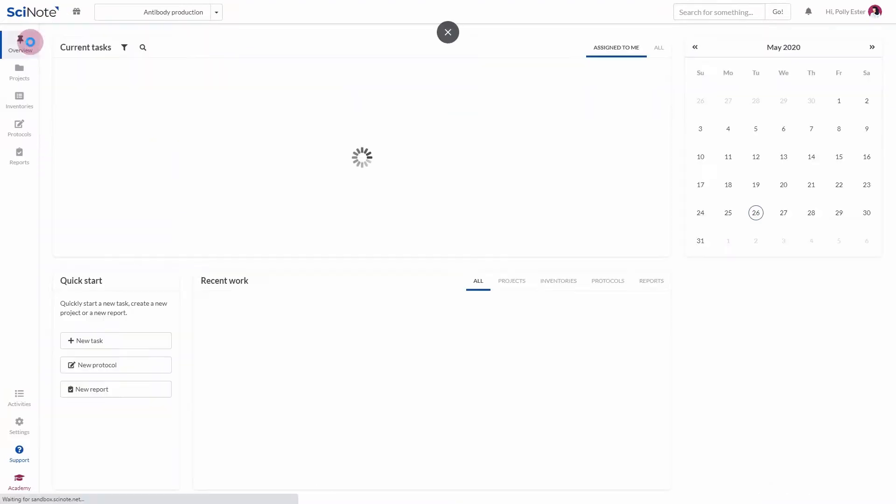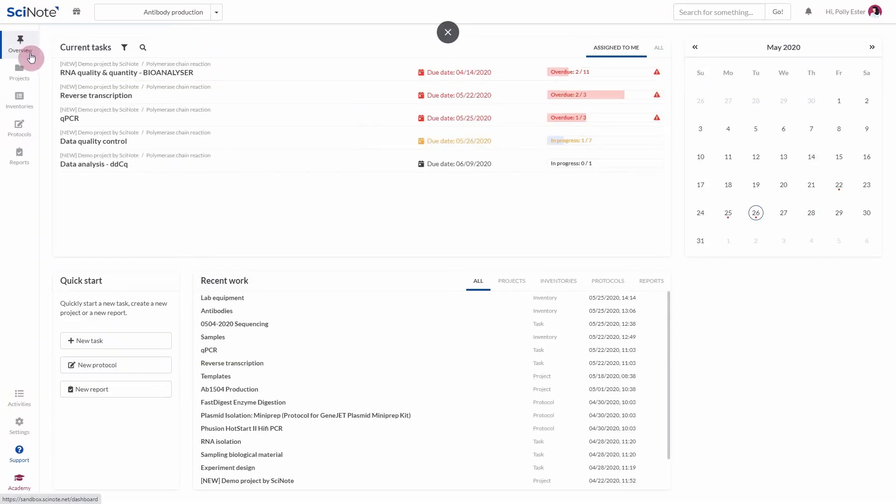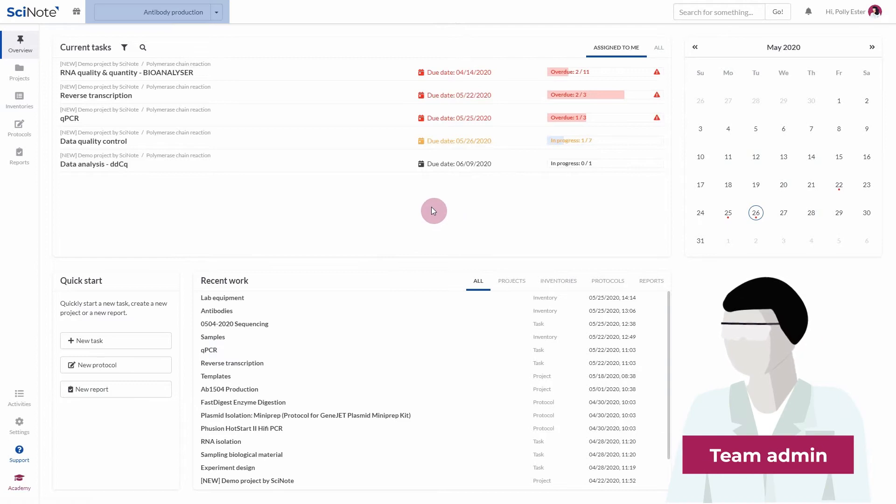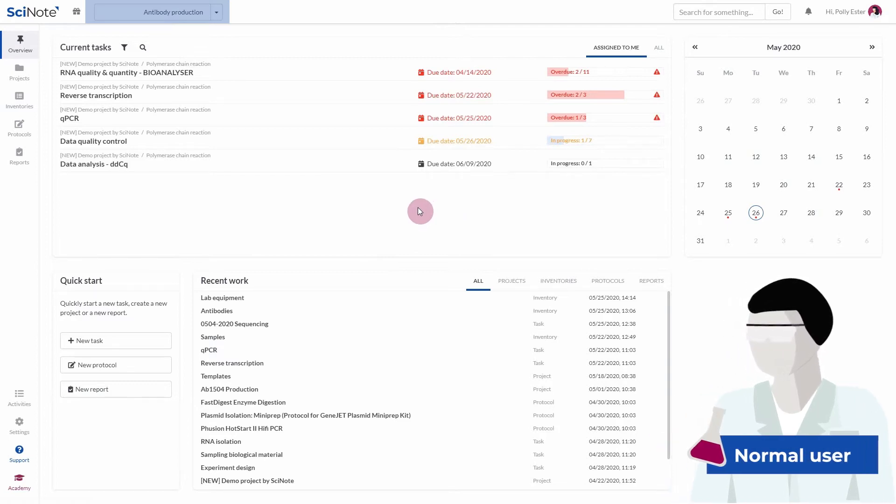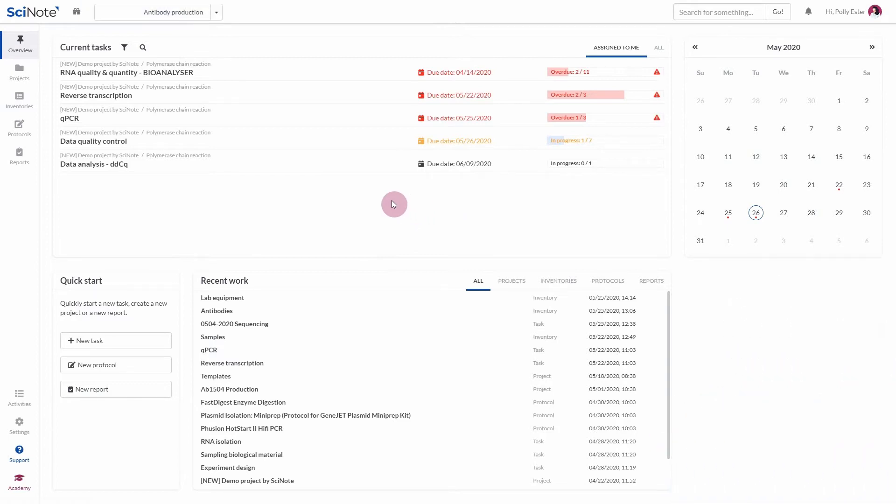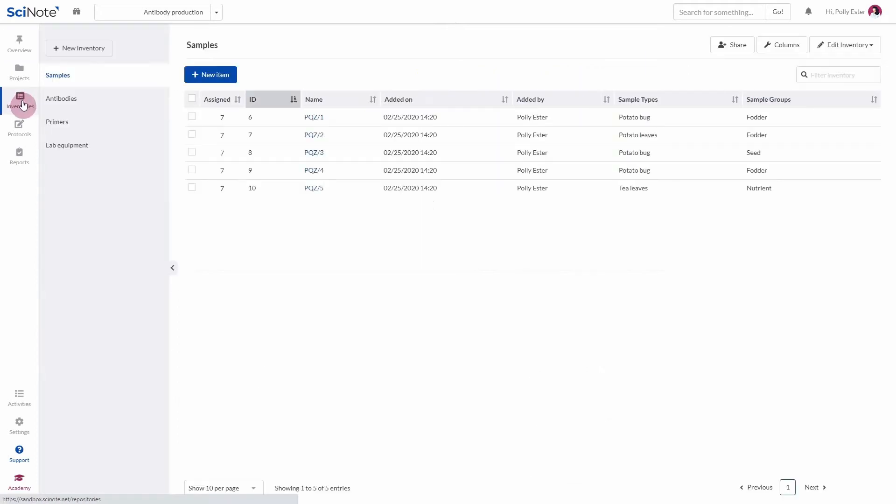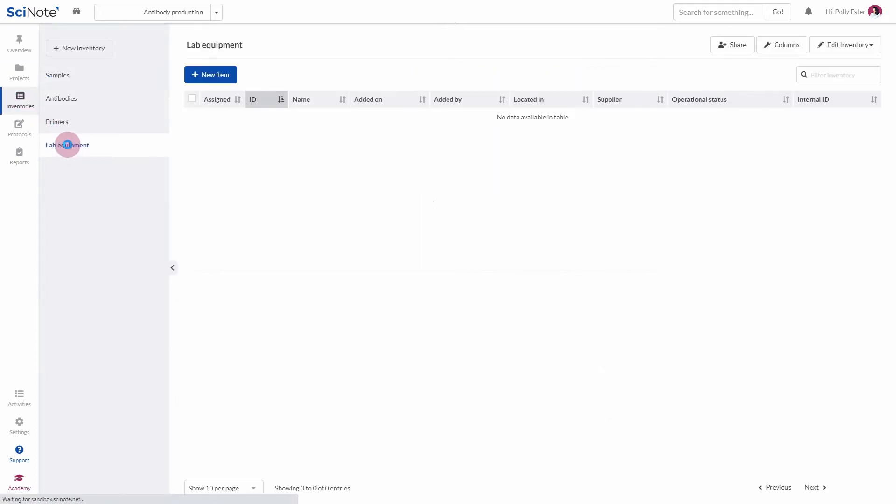To import items, you have to be either a team administrator or a normal user on the team level. First navigate to the selected inventory by clicking on the Inventories tab and then choosing the inventory from the navigation panel.